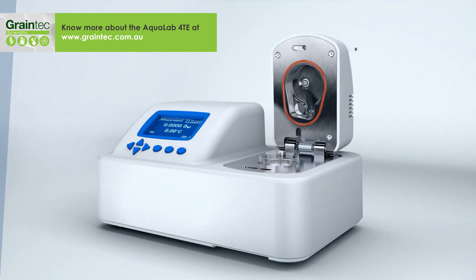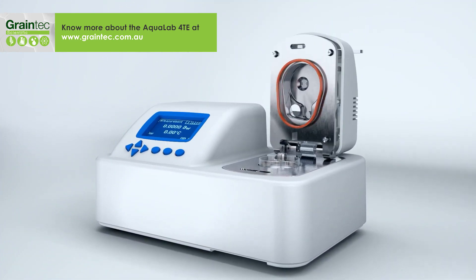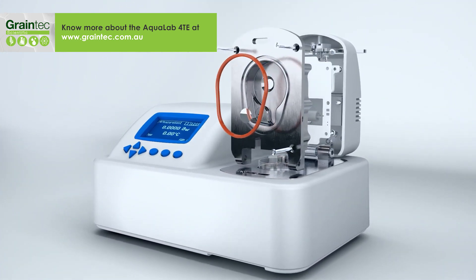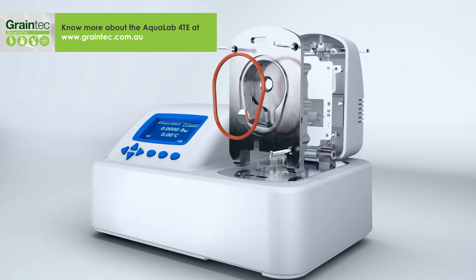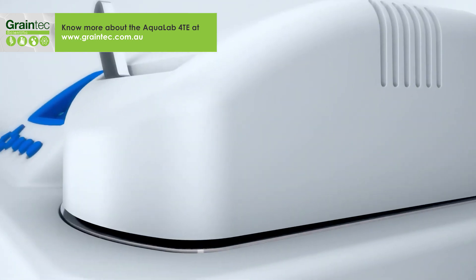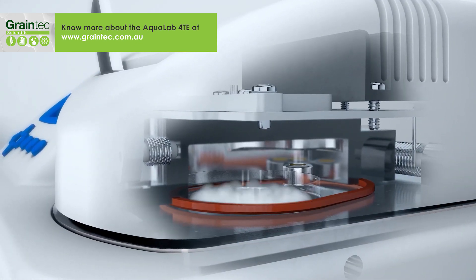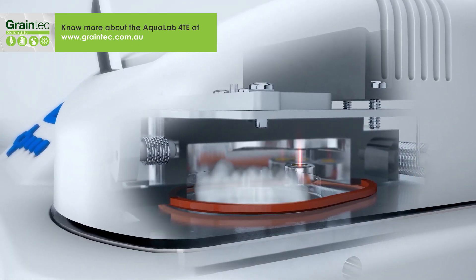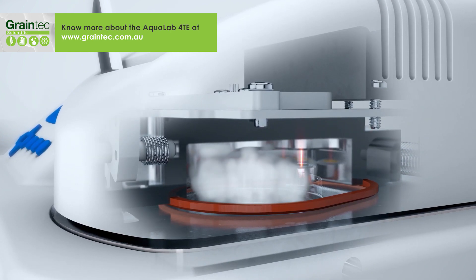The secret to its speed and accuracy is in its unique chilled mirror dew point sensor. Like all water activity meters, the Aqualab 4 TE has to wait for the sample to come to equilibrium inside a sample chamber. But the 4 TE measures water activity faster because the dew point sensor itself doesn't need to equilibrate.